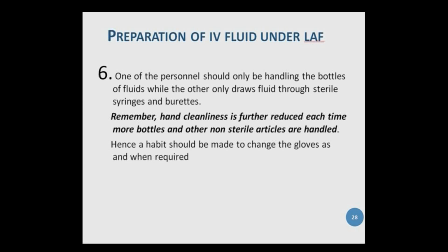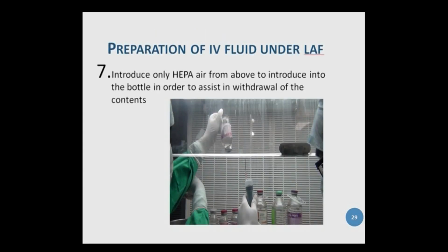Remember, hand cleanliness is further reduced each and every time more and more bottles and other non-sterile articles are handled. So one of the operators will act as a clean operator while the other acts as a sterile operator. Hence, a habit should be made to change the gloves as and when required.